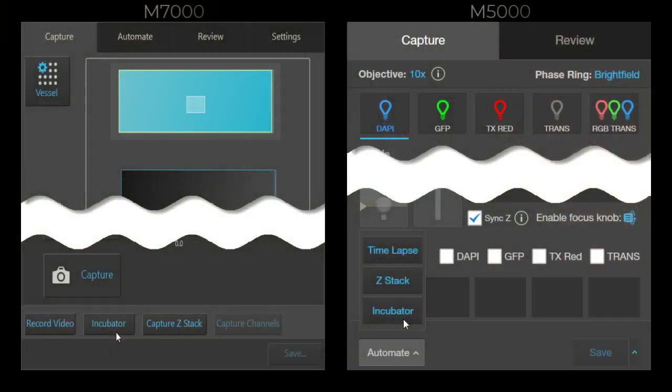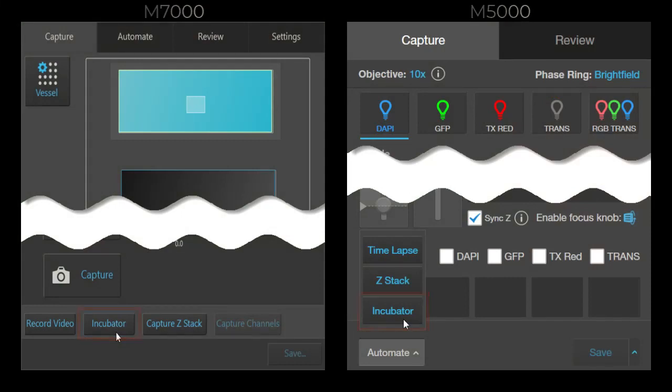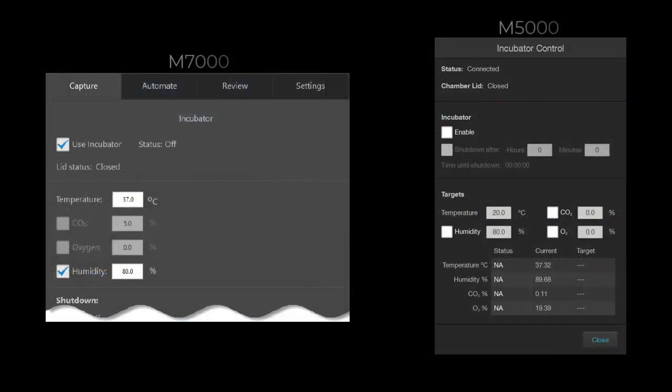To start the incubator, select the incubator button from the capture tab. Select enable or use incubator. Define the target temperature.